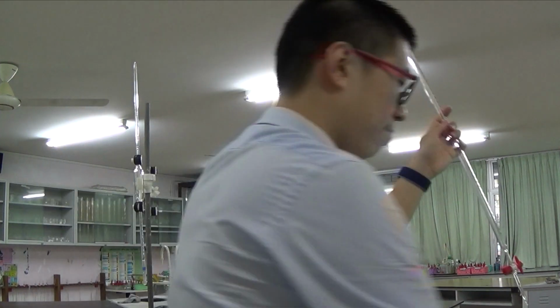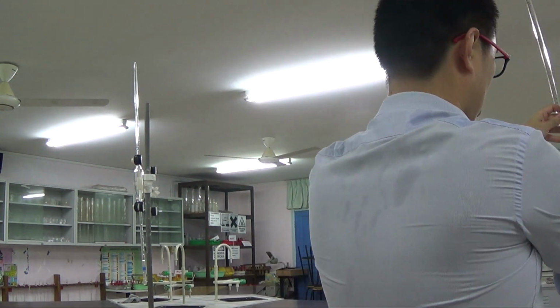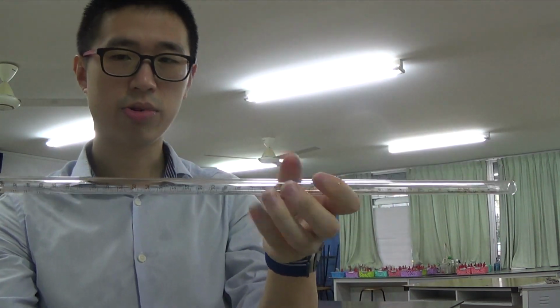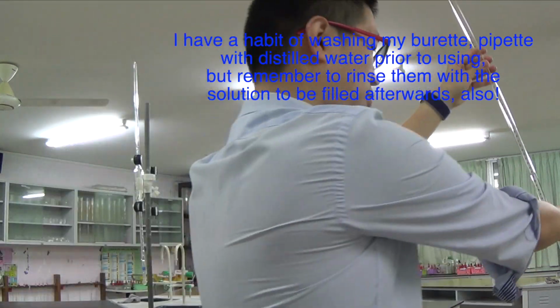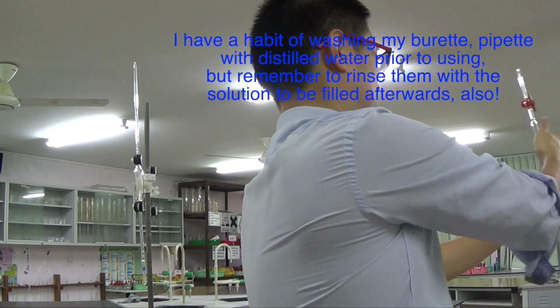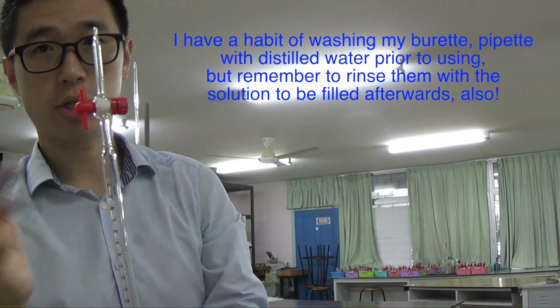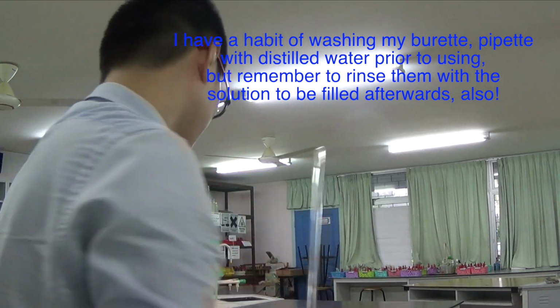I'm going to quickly rinse my burette. By closing the tap at the bottom so that it doesn't leak, I'm going to roll it around. But remember to always open the tap to allow a bit of distilled water to run through for your washing. And remember, you've got to wash your burette with the solution that you're going to fill it with later as well. So that's it really on the initial rinsing part.